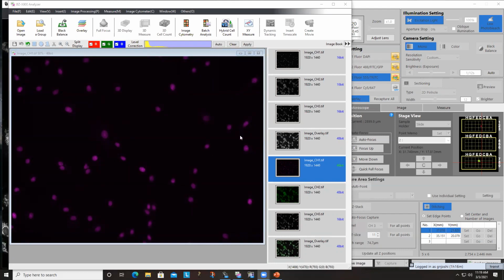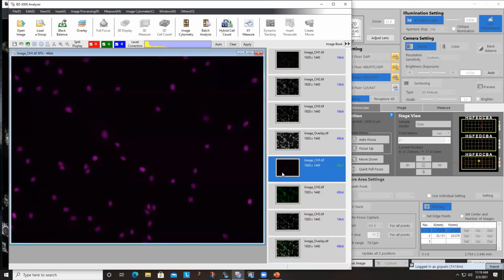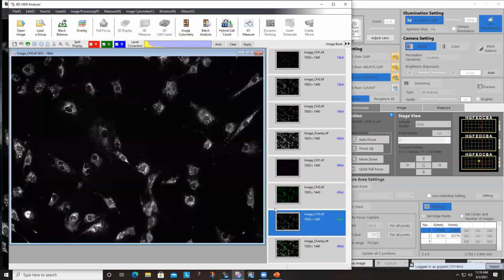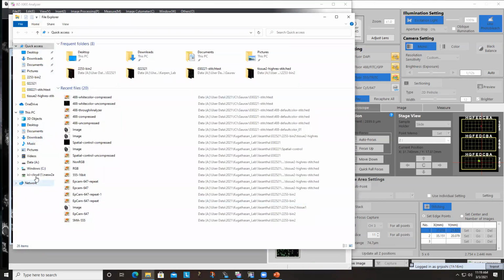the image as an RGB image versus a grayscale image, and that's the most annoying thing about this software. Typically it's just your regular image and then you put a lookup table on it, versus this software somehow just throws something very weird at you. And that can be seen.